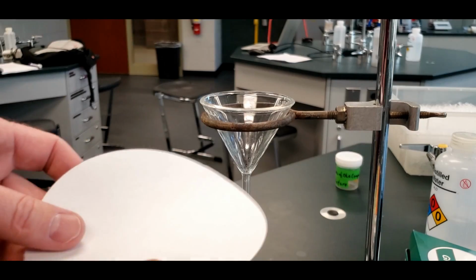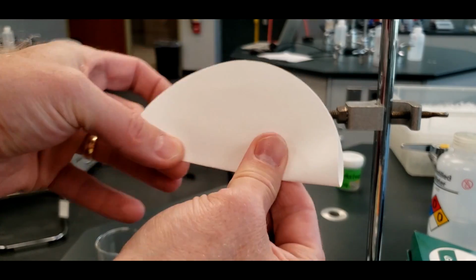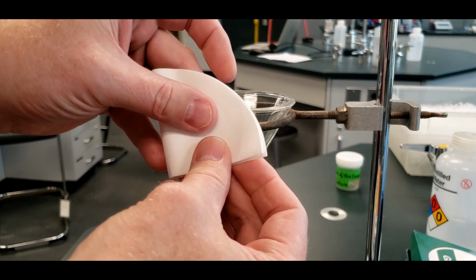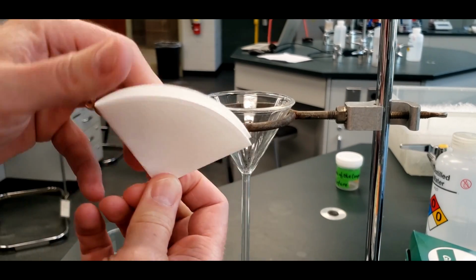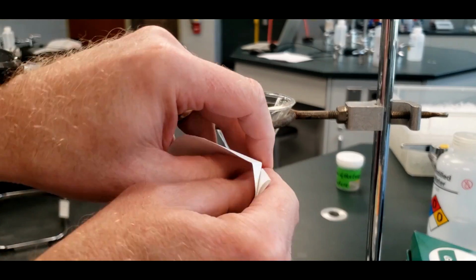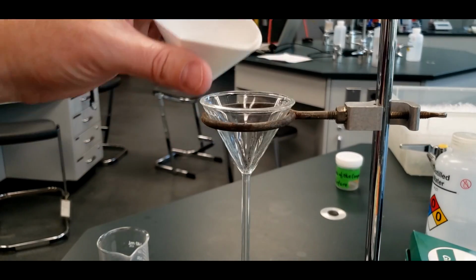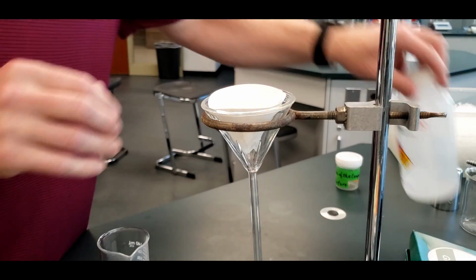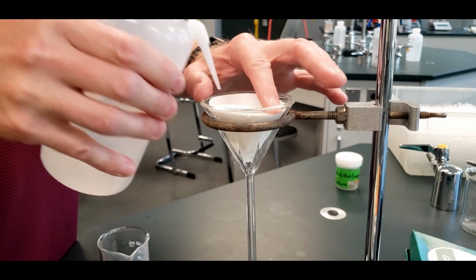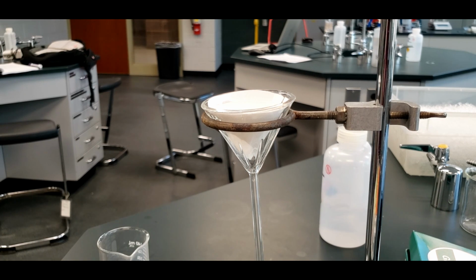All right, so when you're folding one of these, you just fold it in half. And then fold it again. Like that, and then if you see there's 4 sheets now. You just take 3 on one side, 1 on the other, and you open it up. Oops. Something like a coffee filter. And then when you put it in here, you can just zap it with a tiny little bit of water to hold it steady. Keep it from expanding out or popping out of there, and then it's all set to go.